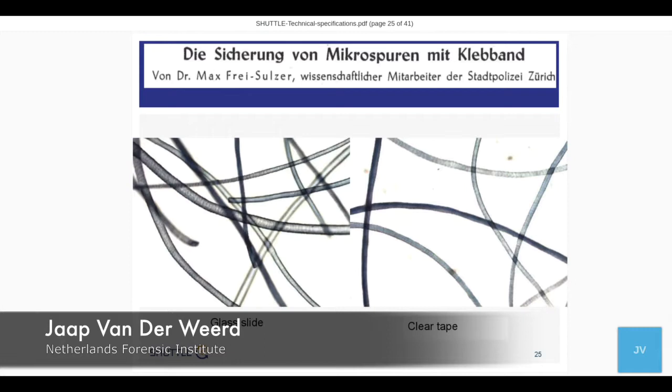And the image is pretty comparable. You see the scales on the wool, you see a clear outline of the different things. The presentation doesn't show you the old-fashioned images through tape. I'm sorry for that, but still there's a lot of improvement compared to the old. So that's a big start as well.